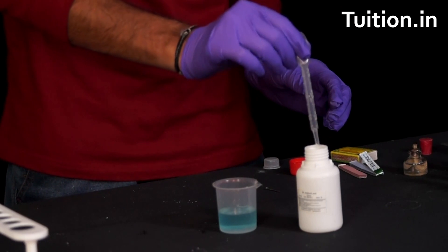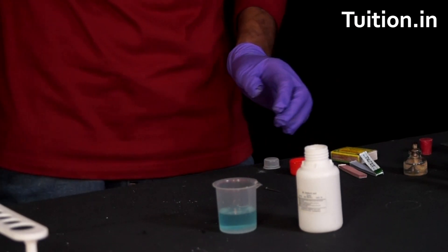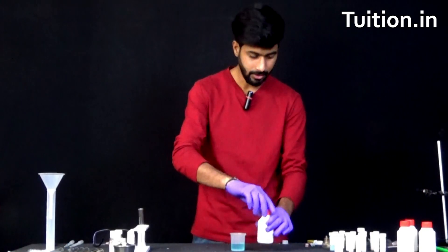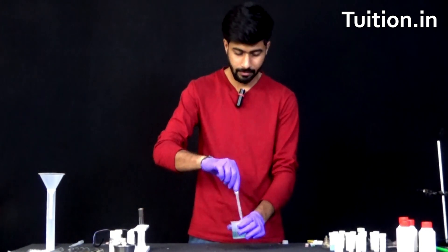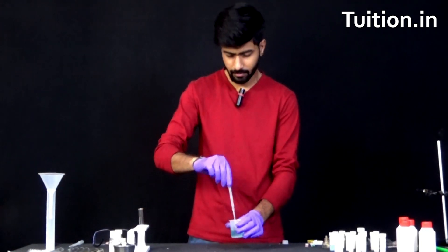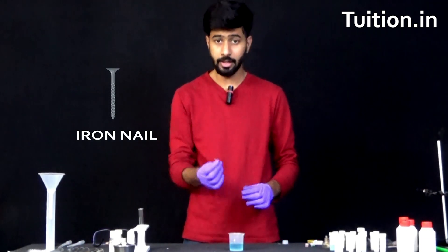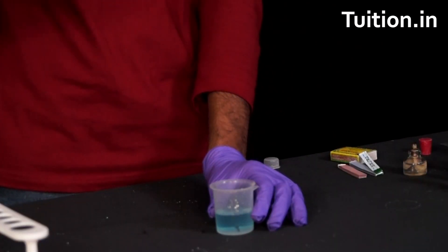So I put about 5 drops of dilute sulphuric acid. Let's close this and put it aside. Let's shake it again. Finally, what we are going to do is we are going to take an iron nail and put it in the solution.